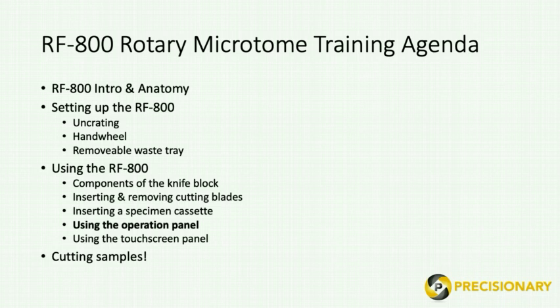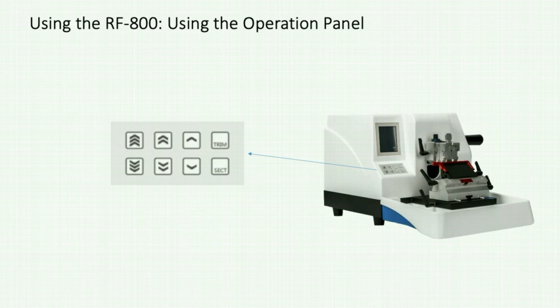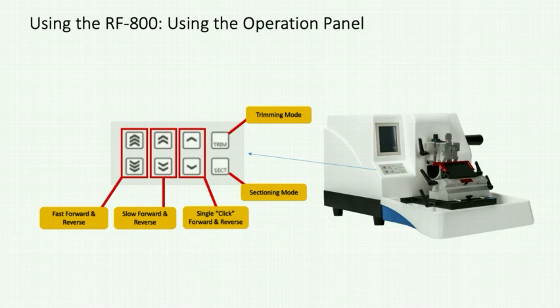The final training today focuses on how to use the operation panel and the touchscreen panel. First, let's look at the operation panel. This is located below the touchscreen. There are 2 buttons that allow you to select trimming and sectioning modes. Then there are 3 sets of buttons that control the movement of the specimen head forward and backward.